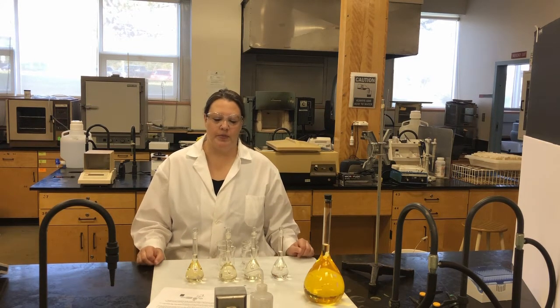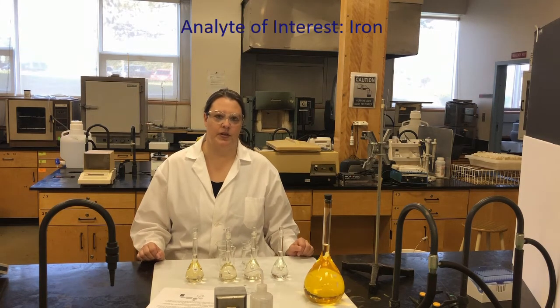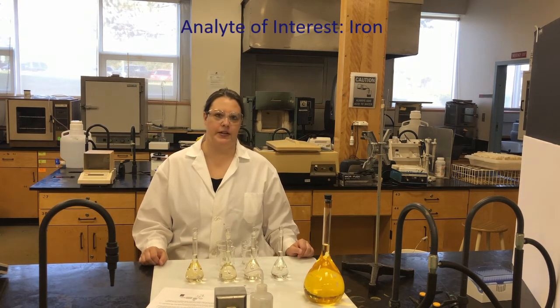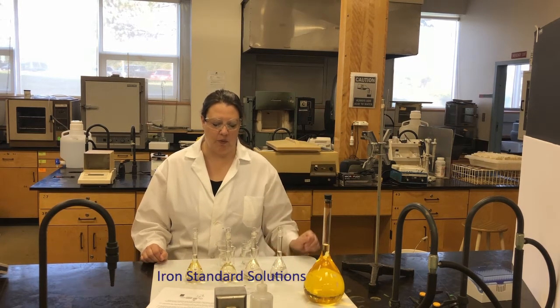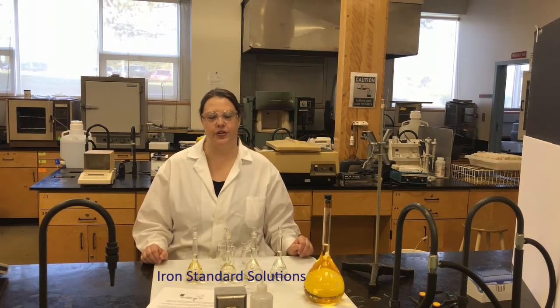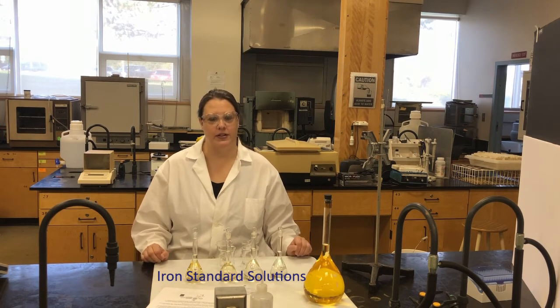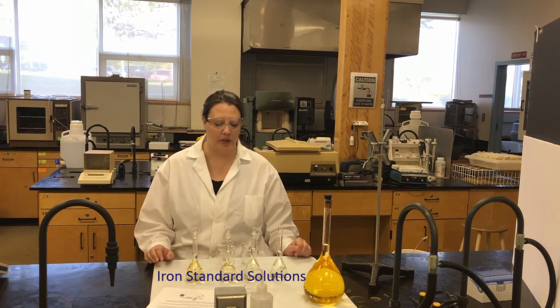So today we're going to be specifically looking at iron content. On our atomic absorption unit, we're going to run a series of standards of known concentrations of iron. I have 4 standards of iron. We'll run those to give us a calibration curve that we can use to determine the amount of iron in our unknown samples. Our unknown samples are water samples.